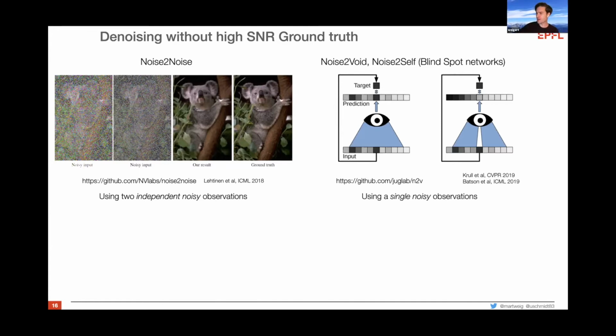So for the fluorescence distribution, I would agree, because every fluorophore has its own characteristic, right? And you should not photon count with it anyhow, because any network will do a nonlinear transformation of your signal in some way. It has to do that. So if you really want to photon count and do some correlation measurements, and count the number of photons coming from the sample, of course, just due to the normalization, this wouldn't work, right? Because that's in the raw data. So you should go back, either restore it, do some segmentation, and then go back to the original data and measure the region of interest that you're interested in, and then count the photons in there, right? Yes.